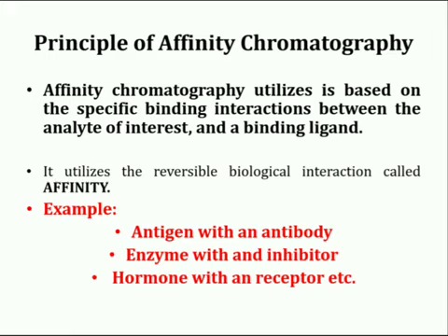Affinity refers to the attaching force exerted in different degrees between atoms which force them to remain in combination. For example, affinity of antigen with an antibody and affinity of enzyme with an inhibitor.